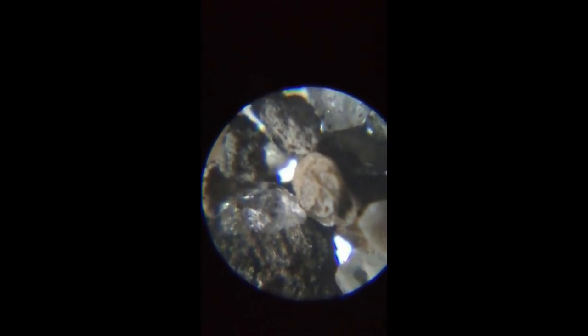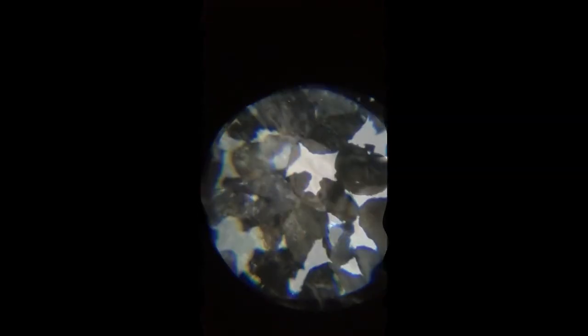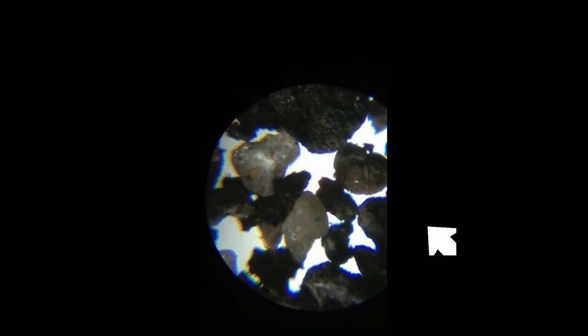А вот и маленькая раковинка, похожа на фораминиферу. Они бывают очень разные. Но всё-таки, похоже, это она. Фораминифер здесь мало. Это простенькая, но это точно раковина. Ну вот, что-то нашли. Вот посерединочке, похоже, ещё одна раковинка фораминиферы. Микроскоп, конечно, у меня не самый лучший на свете, но всё-таки что-то разглядеть в него можно. Фораминиферы лучше смотреть всё-таки под увеличением немножечко побольше — где-то 500. 100 всё-таки это маловато — увеличение в 100 раз — очень трудно будет их разглядеть. А вот 500 в самый раз. Вот существо в правом верхнем углу тоже может вполне себе являться раковиной фораминиферы.